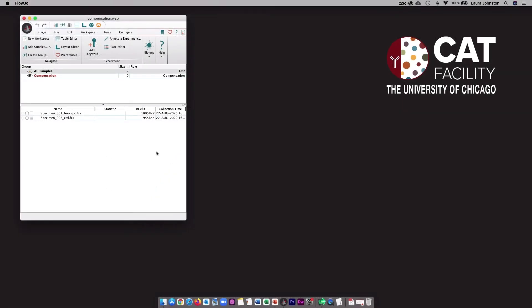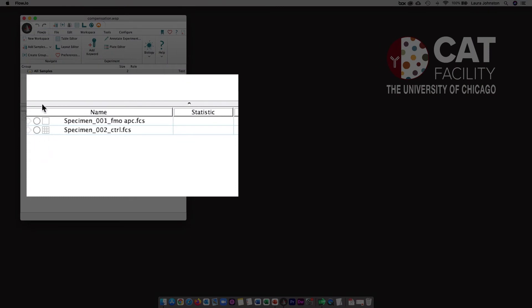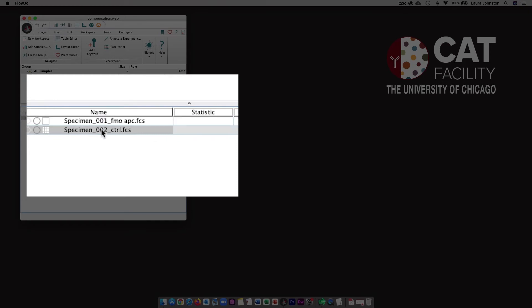For the final part of this video, I wanted to point out a few things in FlowJo because I know we have a lot of users in our facility that use FlowJo. First, I want to show you how to identify if your FCS files already have a compensation matrix packaged into them or not. Immediately after importing your files into a FlowJo workspace, you can check this square icon here. Either it will be empty or it will have a grid in it. For specimen 1, you can see that it's empty, and that indicates that there is no compensation matrix packaged into this particular FCS file. The second file here does have a grid in the square, and that means that there is a compensation matrix packaged into it.